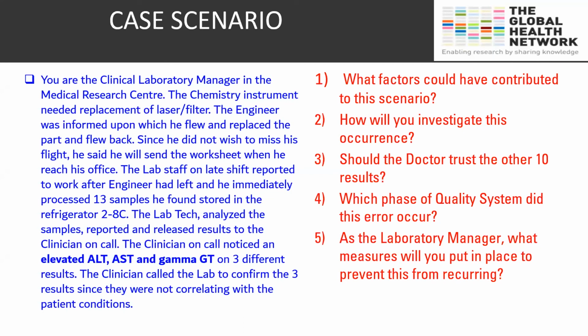Yeah, go ahead, Franklin. I like this one from Steven. He says you have to complete a non-conformity form as a guide in the investigation. For example, the problem reporting, personnel classification, and then you do a root cause analysis and take corrective actions and preventive actions. Yes, the key word there is root cause analysis. I agree. And then you complete the backup form. I agree. Root cause analysis must be done.